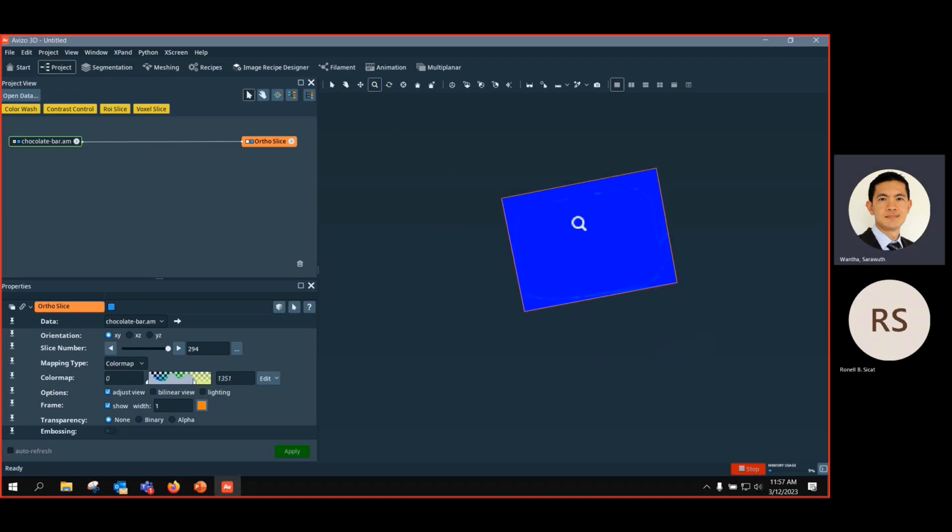So you can click on zoom and zoom in using the middle mouse wheel to zoom in, zoom out, but it's really slow. You can do it by using a shortcut. You press the left and middle mouse buttons together, left click and middle mouse wheel, and then you can zoom in, zoom out very quickly.